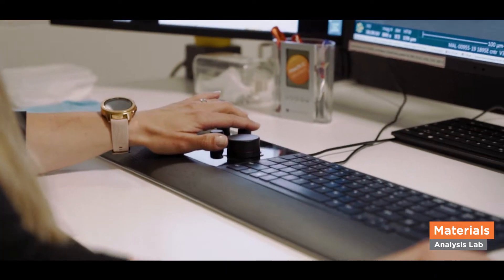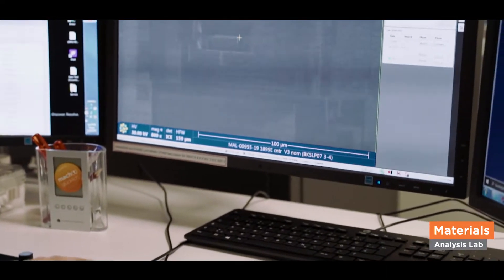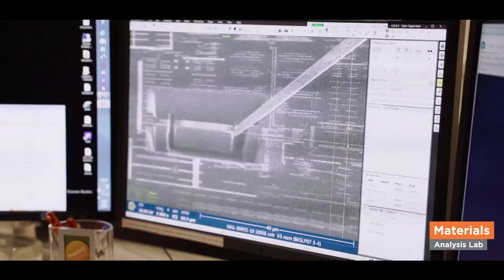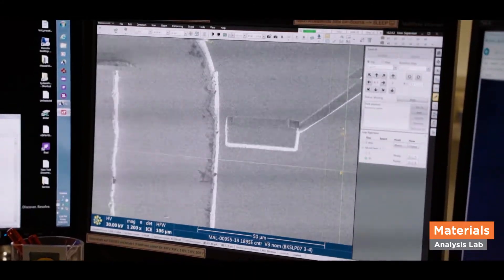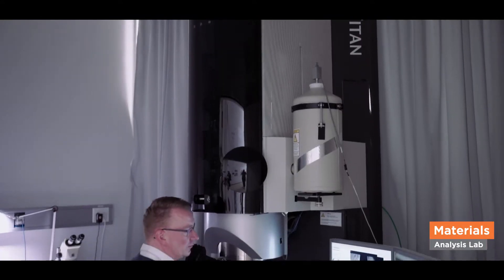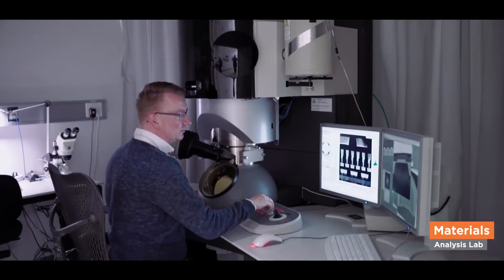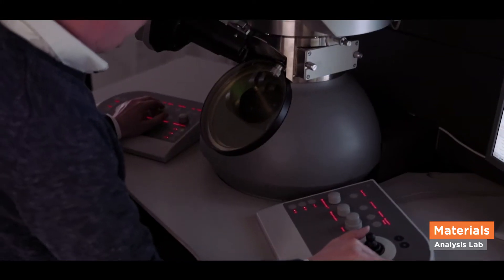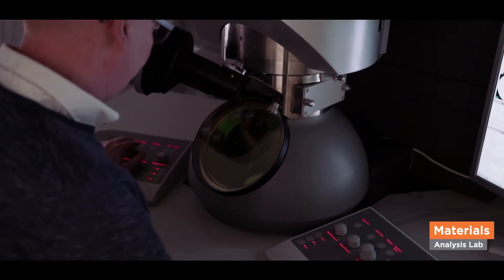What is especially fascinating is that we can actually touch the wafers and look directly into the chips. Focused ion beam instruments are used to create cross sections of the smallest structures on the chips. With electron microscopy we can achieve the highest magnifications, looking at individual atoms if needed.